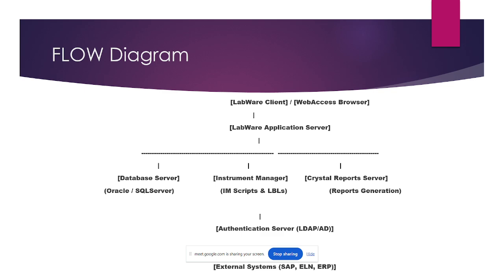Once these servers are created, we need to integrate them with the lab application server. Whatever we created, the required database servers, instrument managers, and Crystal Reports server, we need to integrate with the application server, meaning we need to build them up with the application server.